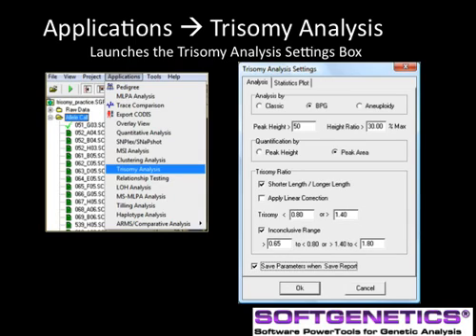By checking the save parameters when saving report option, a separate file with these analysis parameters will be saved when the file report is saved, providing additional verification and audit trail of the analysis.